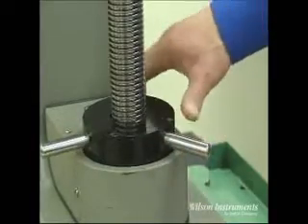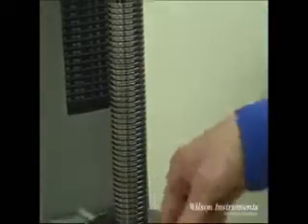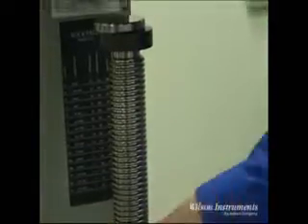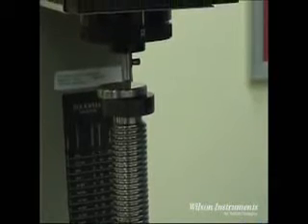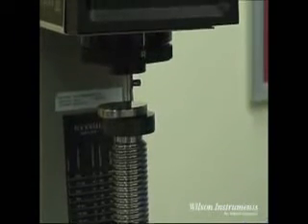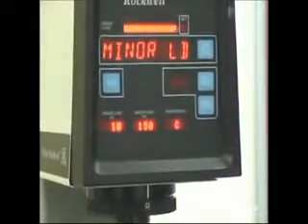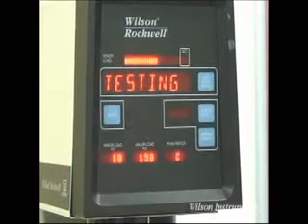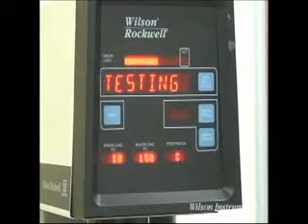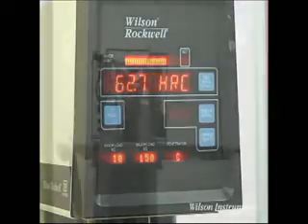Traditional deadweight testers typically use a mechanical means to drive the test specimen up towards the indenter, usually through a rotation of a spindle handle. The indenter is fixed to a rod which is attached to a pivoted lever. The pre or minor load is applied first by either a calibrated spring or a small mass fixed above the indenter rod. Once a specimen contacts the indenter, the user must continue moving the spindle up until minor load is achieved, indicated by an automatic break or a graphical display which monitors location. Major load is then applied and the results are automatically displayed.